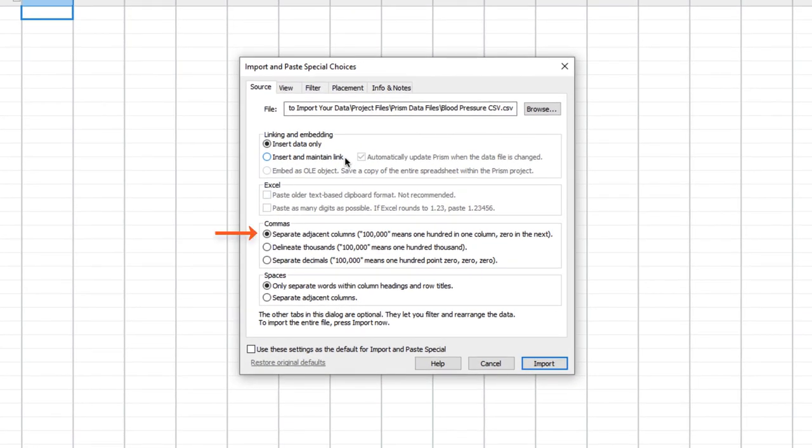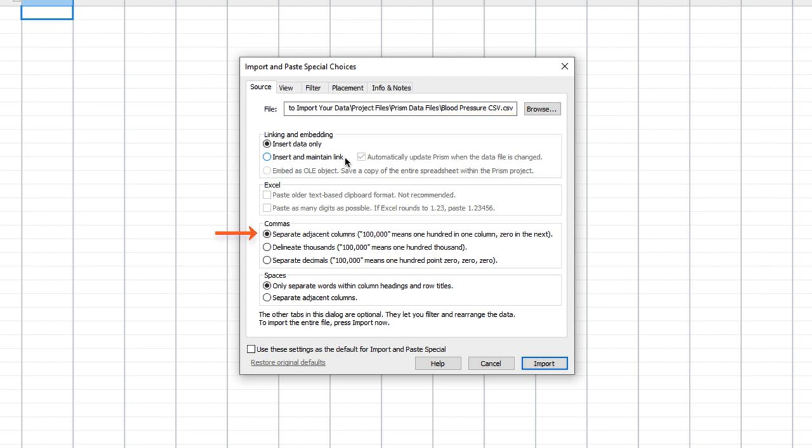For example, if commas are used to separate columns, as a thousands placeholder, which is common in the United States and Great Britain, or as a decimal placeholder, common in most of Europe. In our case, we've chosen to import a CSV, or Comma Separated Values, text file, which, as the name implies, separates its columns with commas. Based on this knowledge, we would select the first option, Commas Separate Adjacent Columns.